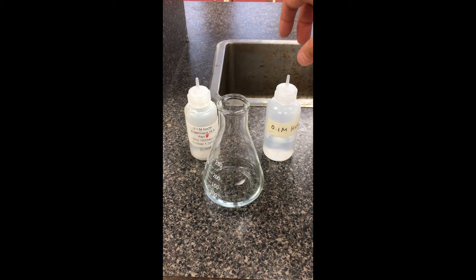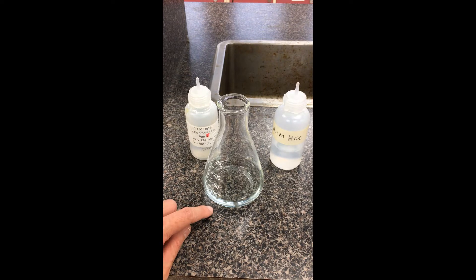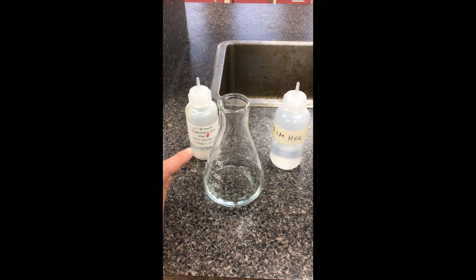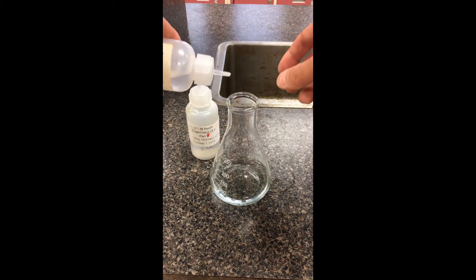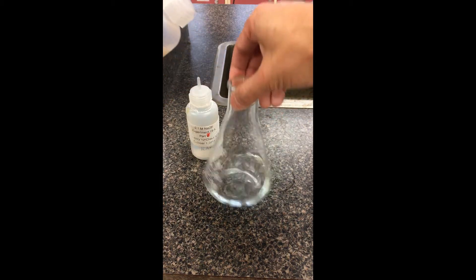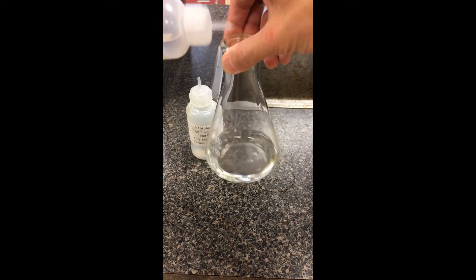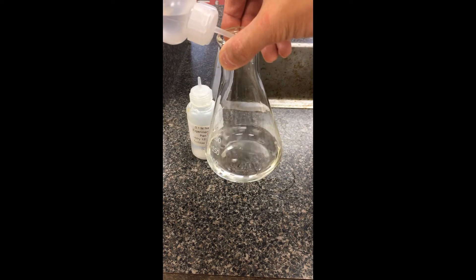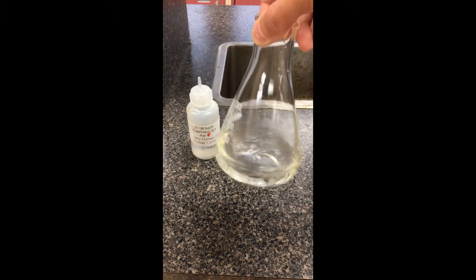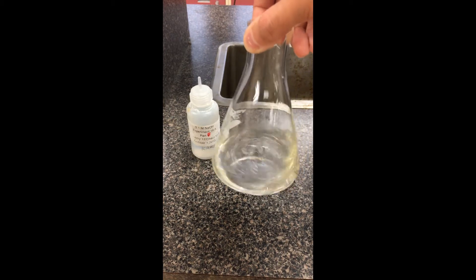We're going to start off by adding the acid — I have 0.1 molar hydrochloric acid. We'll note any changes in color, and then to neutralize the acid we'll add the same concentration of sodium hydroxide, again tracking any changes we see. Adding a little bit of acid — you can see the color is already a little bit different, more of a yellow tone. If I had stronger acid I might get the color change even more. It's definitely a lot more yellow than it was before.